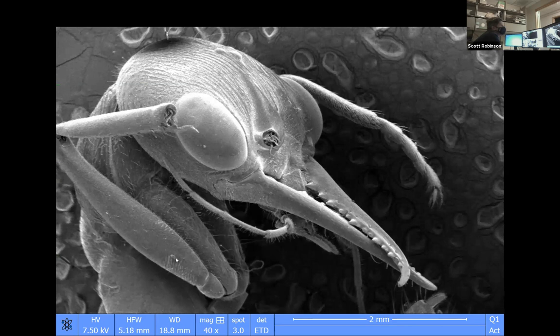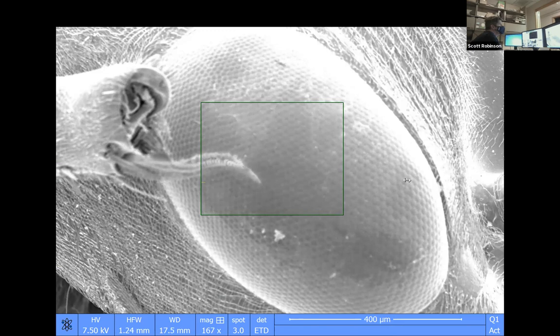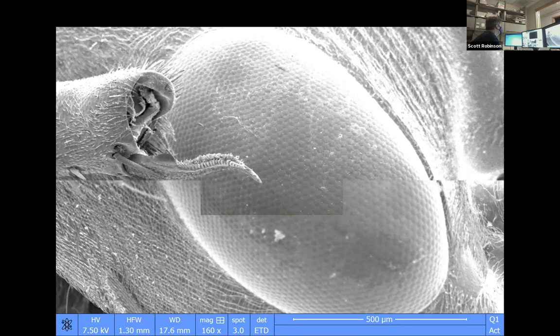So what's this? Yeah, so this is the Myrmecia again. I don't remember what color it was when you put it on there. Brown, I think. It's probably a Myrmecia, and I think Nigriventris is the species name. They're called jack jumpers. They're a fairly sizable ant, maybe about the size of a big black carpenter ant you find around here, maybe a little bit bigger. They're quite visual, and they're called jack jumpers because they're quite accomplished jumpers for ants.